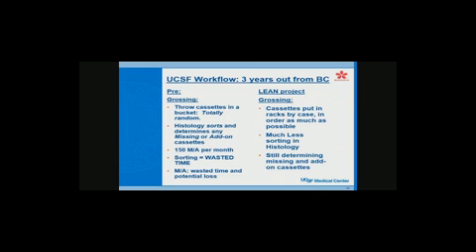This is one of our early attempts at mapping a workflow on a board. We would sit in a room, talk out the whole path, and once this was finished, we would put it into a Visio diagram, so it was easier to look at.